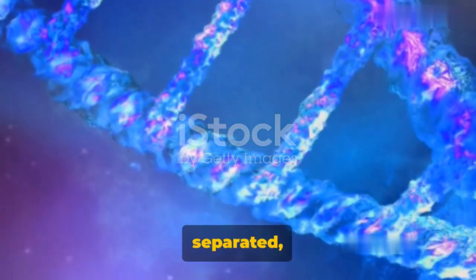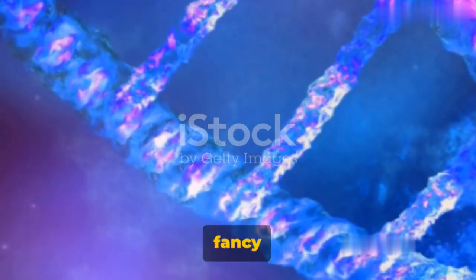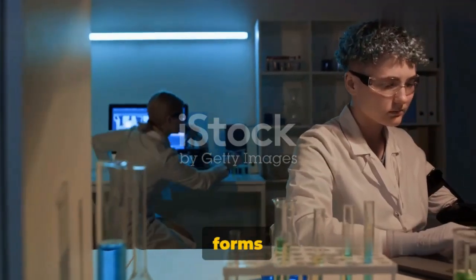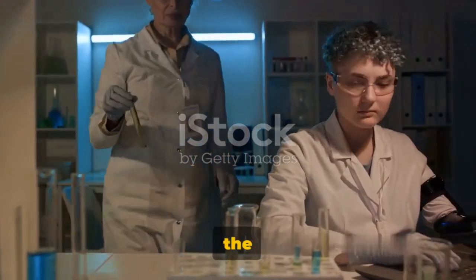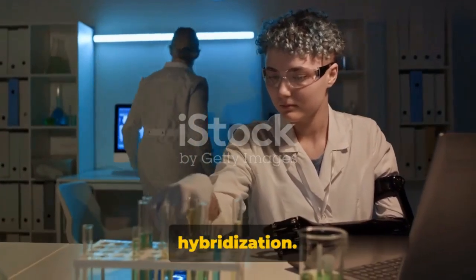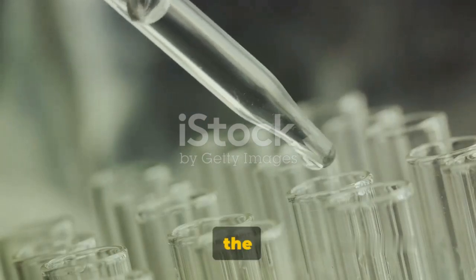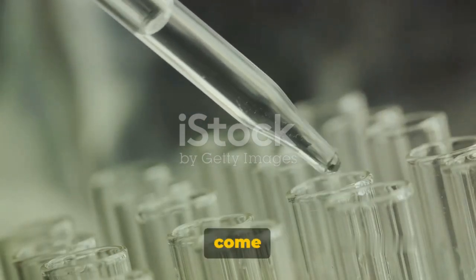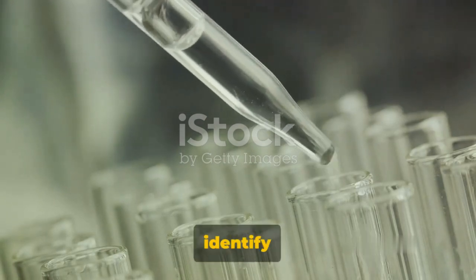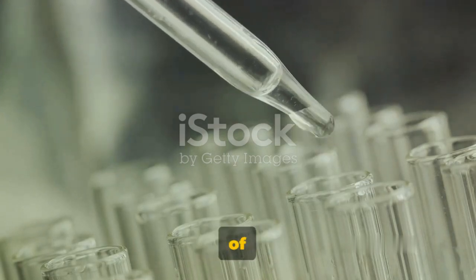Once the RNA is separated, it's transferred to a nitrocellulose membrane. This is a fancy way of saying that the RNA is moved onto a solid surface where it forms covalent bonds. This means the RNA sticks to the membrane, ready for the next step. Then comes the hybridization. This is where labeled probes, which are complementary to the RNA transcript we're interested in, come into play. These probes bind with the RNA, allowing us to identify and measure our target RNA. It's like fitting together pieces of a puzzle.